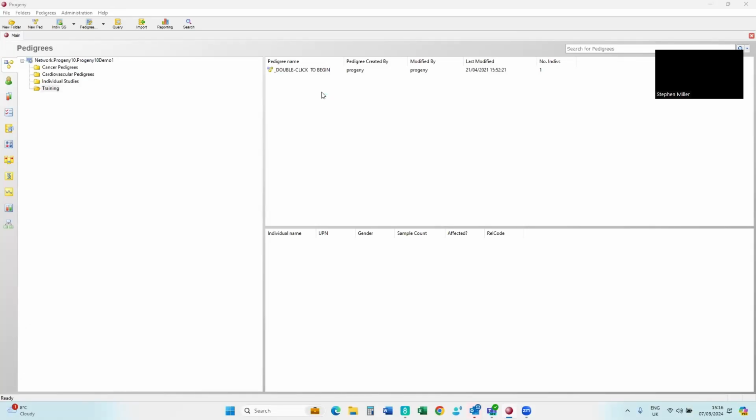I've been asked to go over the audit facility in Progeny Clinical. So I'm going to briefly go over that. There's a few places where you need to work to see the audit side of things. So the first place, this is the PC client. I'm only talking today about Progeny 10.